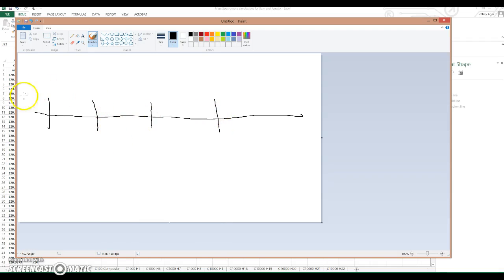Now, if we're going to do that, I'll show you how in an Excel sheet. But now what else I want to do is introduce a second slider here that we talked about, which is the number of protons. Here's if you only add one proton. Here's, for example, if you add 2 or 3 protons. And then maybe here's 7, 8, 9, and then 20, 30, things like that. So that's how that works.